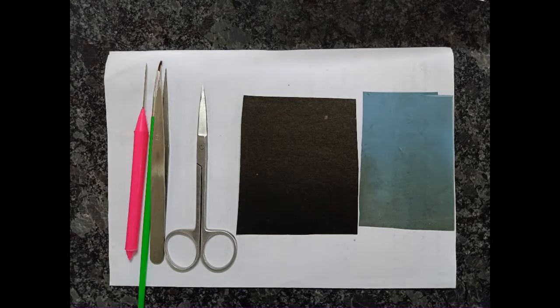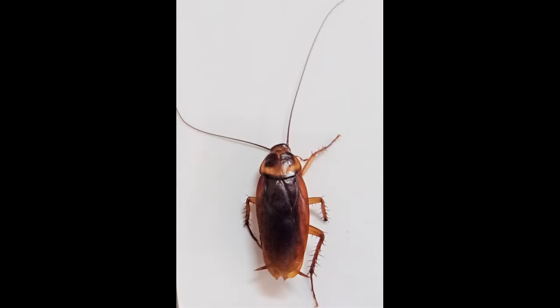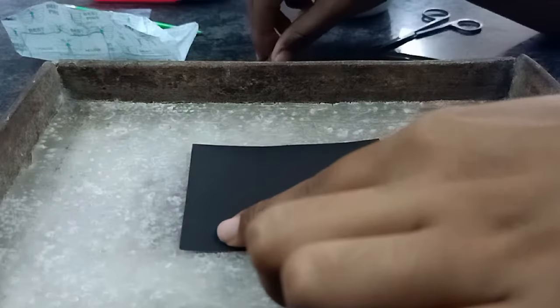Dissection needle, brush, forceps, scissor, black chart, X-ray sheet which is cut into thin strips, bell pins, dissection tray, bowl with water, spirit, and a chloroformed or freshly killed cockroach. With the above materials, now we start the dissection.